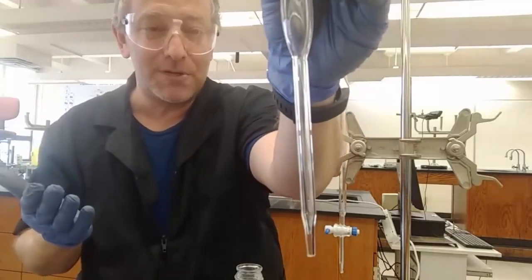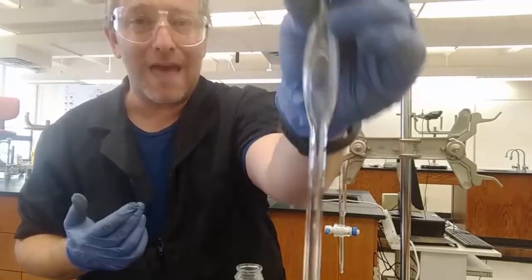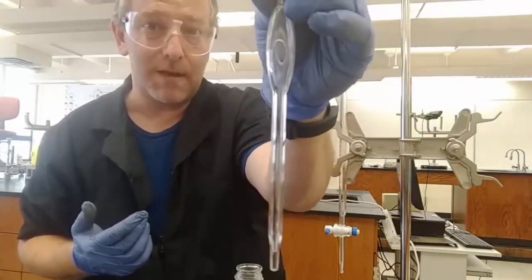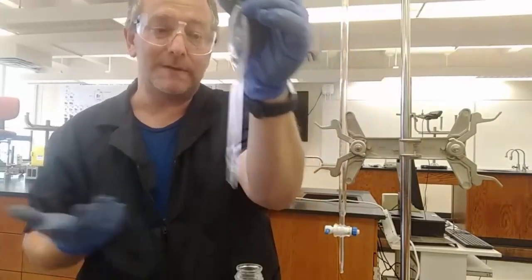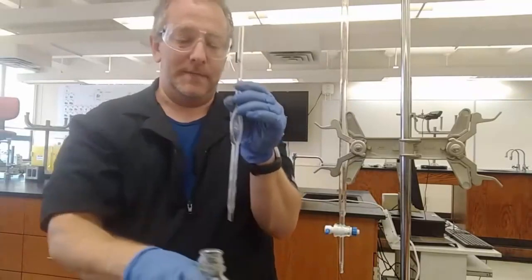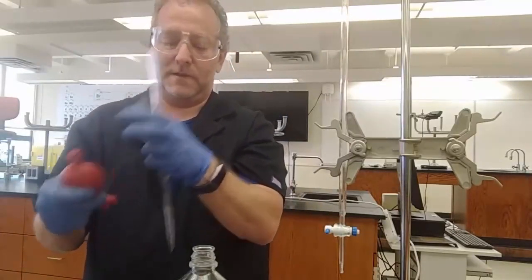You want to look for opportunities where things that have gone wrong in the lab can be explained. We haven't delivered exactly 10 milliliters, which is the whole point of using this pipette, so that we'd exactly deliver 10 milliliters. It is what it is. So that's flask number one, done. We'll do that again with flasks number two and three.